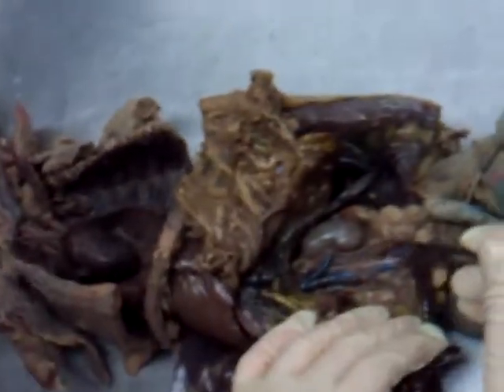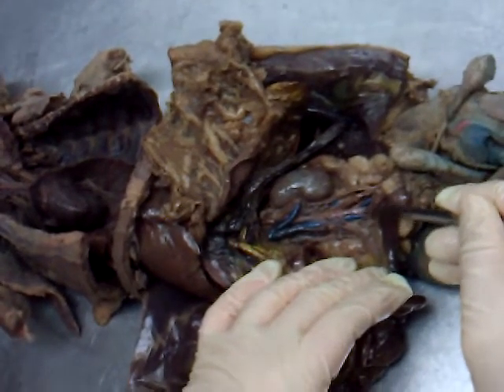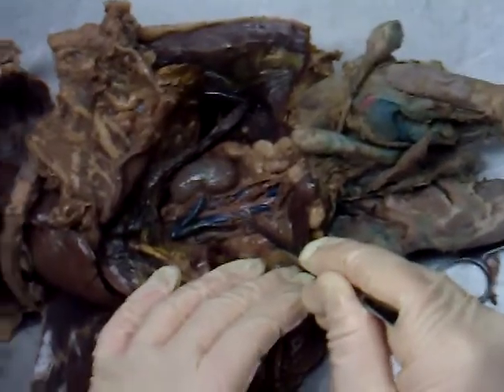You can see the abdominal aorta all the way down to here, and you can also see where it's going to branch — one branch here, one branch here. Those two branches are the external iliac arteries: left external iliac and right external iliac. Right behind them are the external iliac veins that combine to form the inferior vena cava.